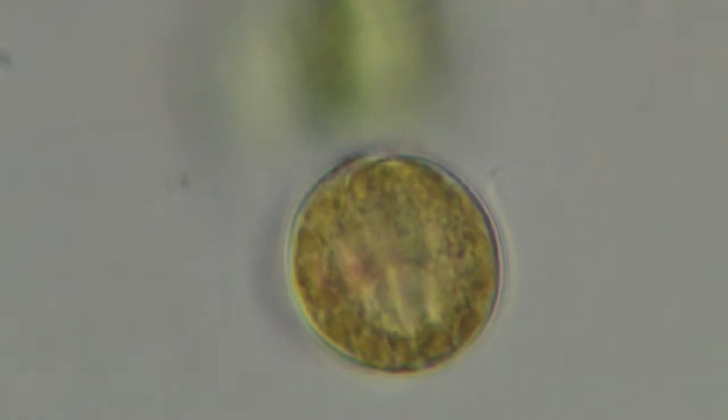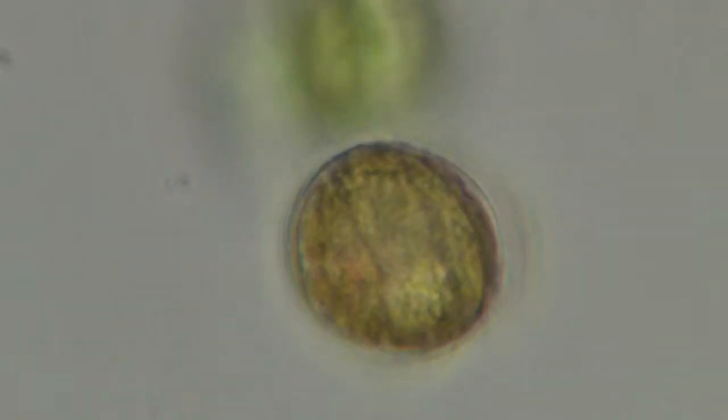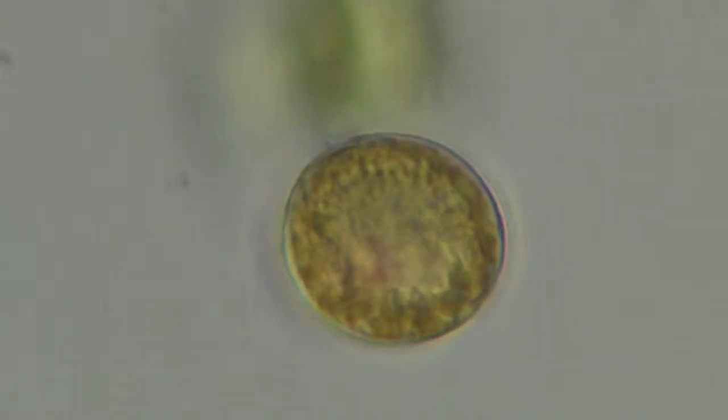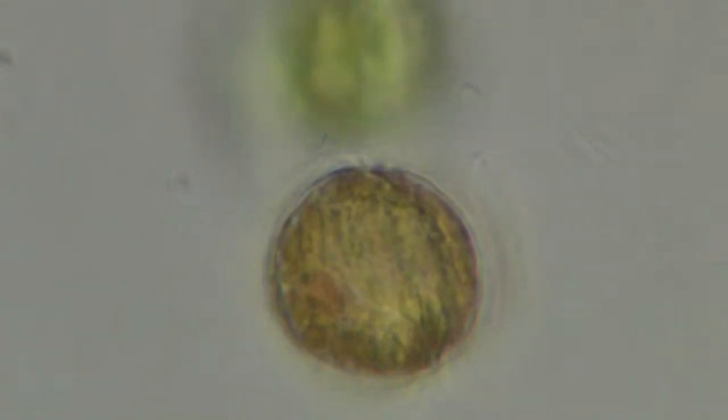There's that waving flagellum at the top. Almost looks like heat coming off of it, but it's a slowly undulating flagellum. Oh, are we going to get the groove turned a little bit? Hey Dave, what's up? Almost make out the groove focusing through it because it is transparent. I'm not quite getting it, but I like the eye spot. That's a cool look.